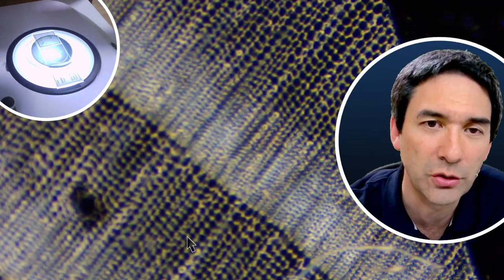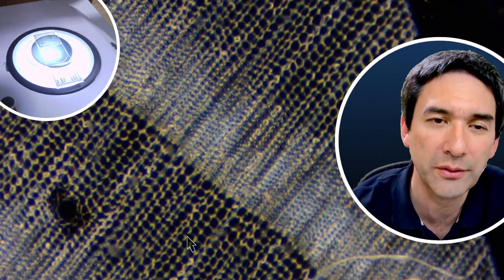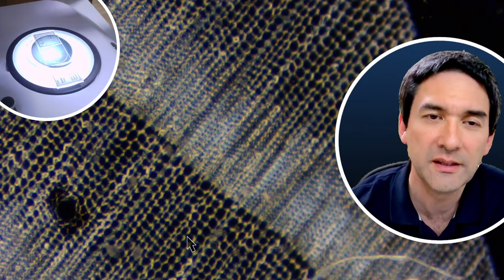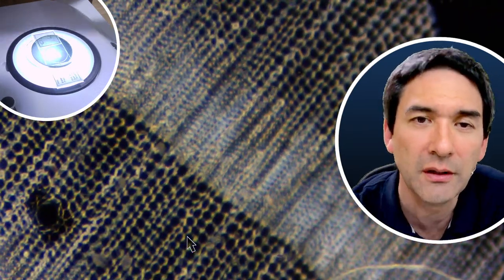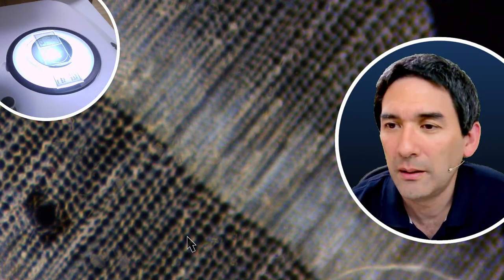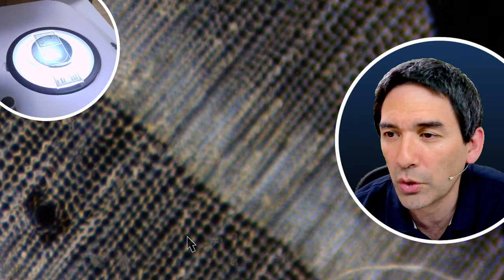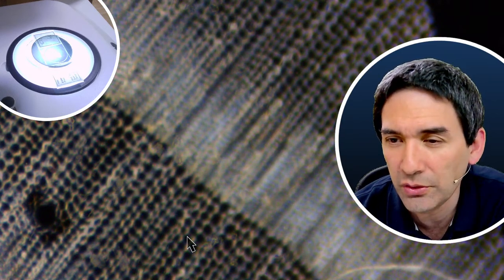So again, this is not dark field, which produces somewhat of a similar effect of a bright image on a dark background, but this wood here, the individual wood cells, depolarize the light in such a way that it appears bright on a dark background. Yeah, I think it's also quite nice looking. Okay. So, insect wings are also very beautiful under polarized light, but I don't know how well it works with cross-polarization. Okay, well, something to try out.